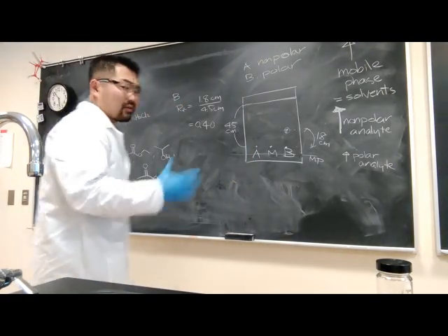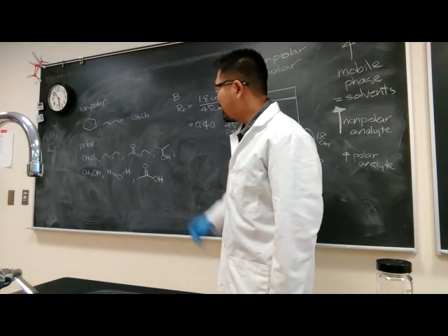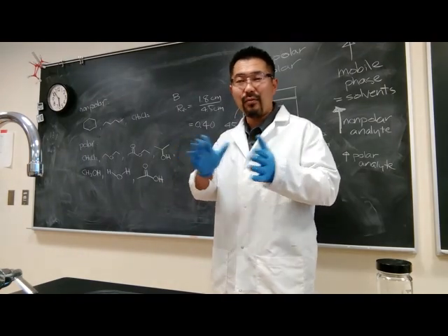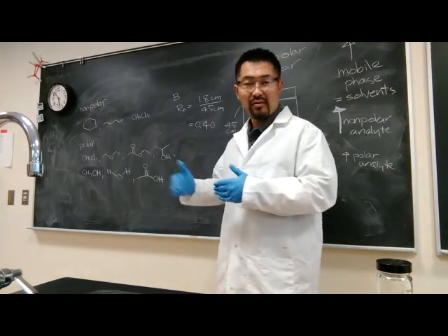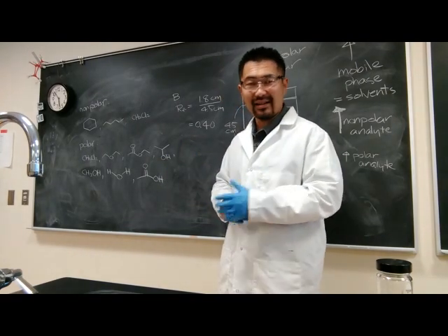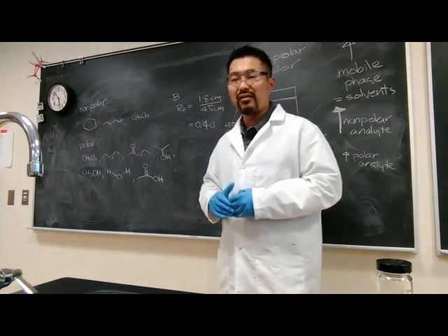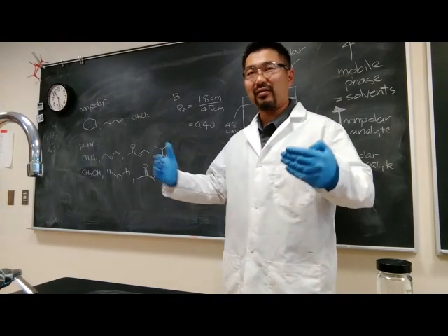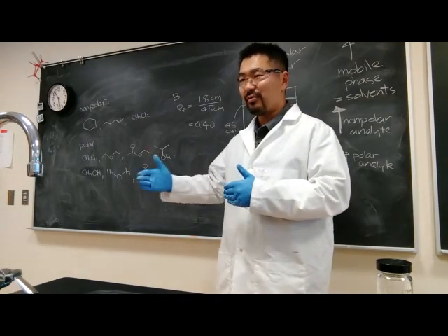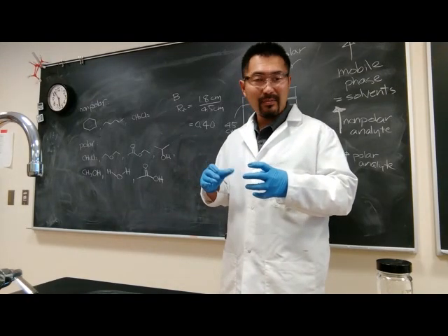Okay. So to do that, we have some choices for the solvents or the mobile phases, and you have some choices because I want you to actually, through trial and error, aka through experimentation, like a scientist, because in organic chemistry, one of the goals in the course is for you to start to develop as a scientist, and to be a scientist, you'll need to be able to, through experimentation, determine something that was not previously known.